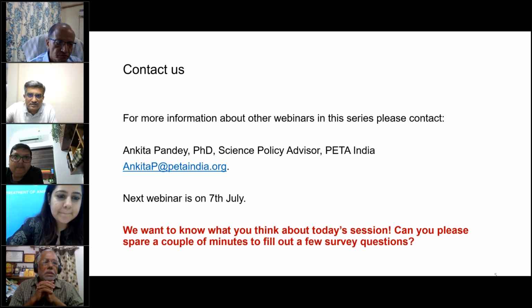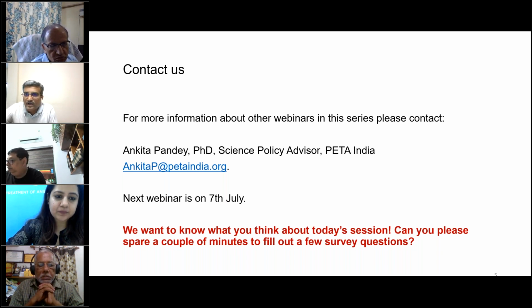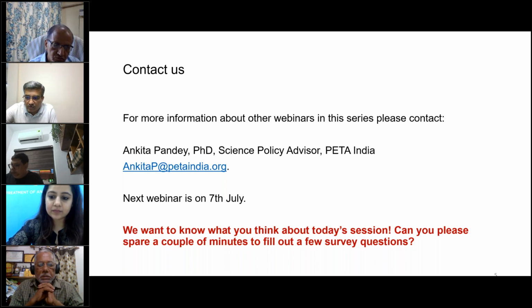Not like we have one test or two tests that determine or cover the whole classification. As of now, there are different aspects we need to consider. That is the test material property and also the application where we use the material, so the application scenario also we need to consider. Moreover, we have different in vitro methods, and their advantages and disadvantages have to be looked into and then matched with the test material properties. With that, we will get the desired outcome. So there is nothing like do one and then two and then get the result. That's the situation as of now.